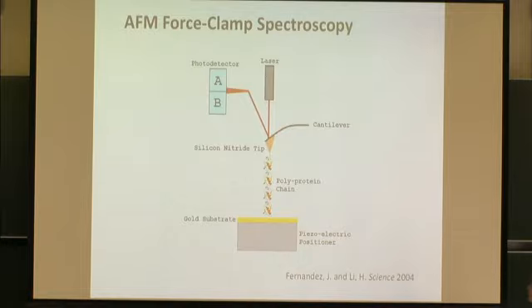So this is a little bit more detail of what the experiment looks like. You use some gold to actually deposit the protein.